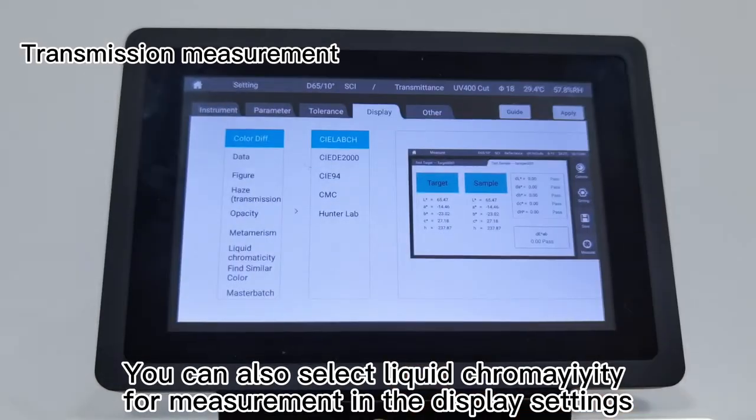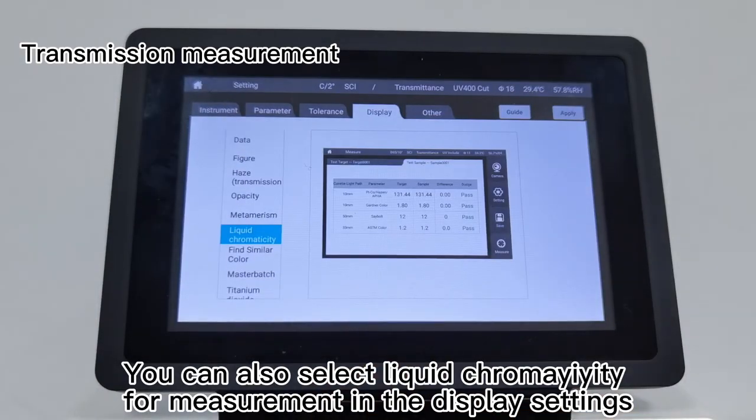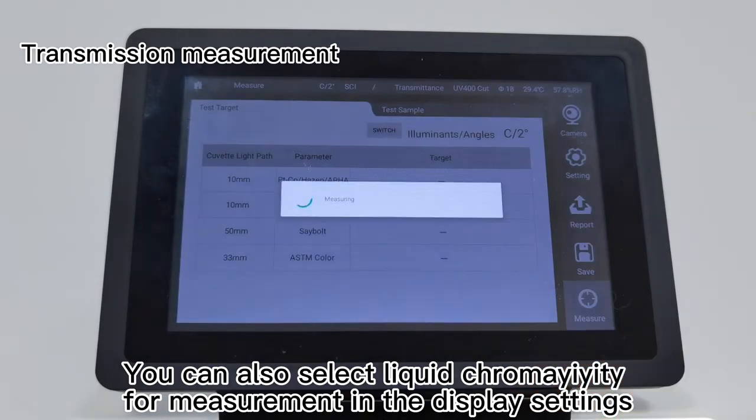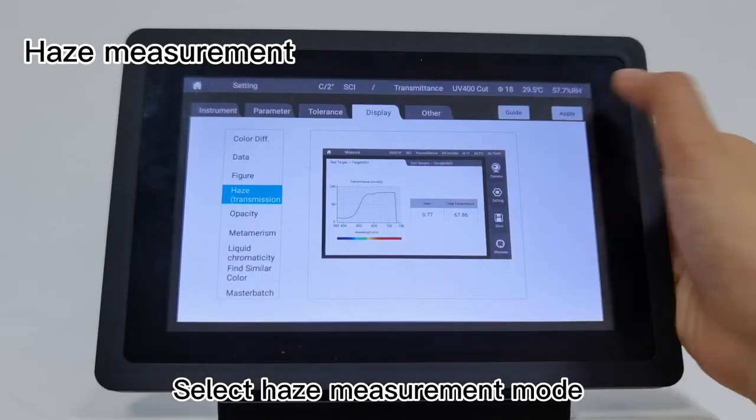You can also select liquid chromaticity for measurement in the display settings. Haze measurement: Select haze measurement mode.